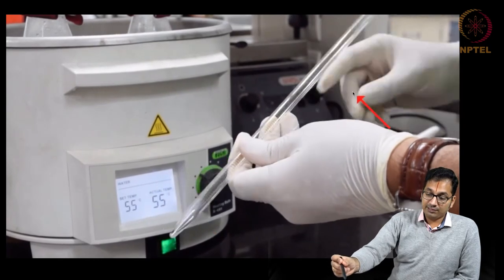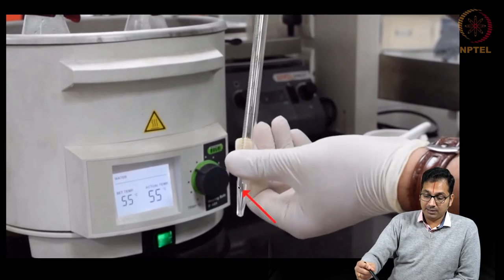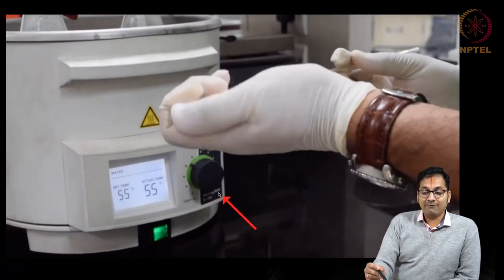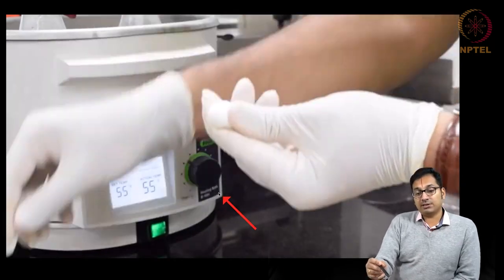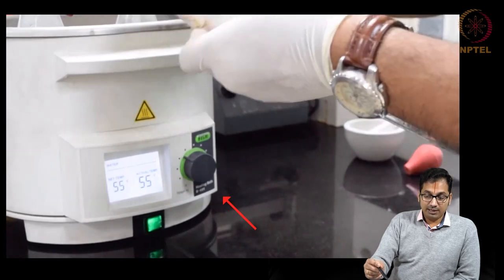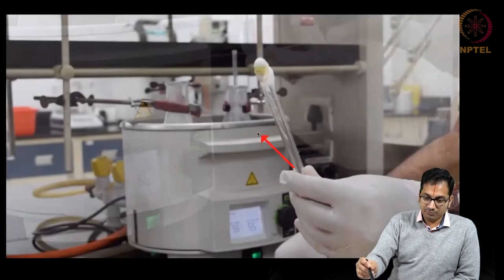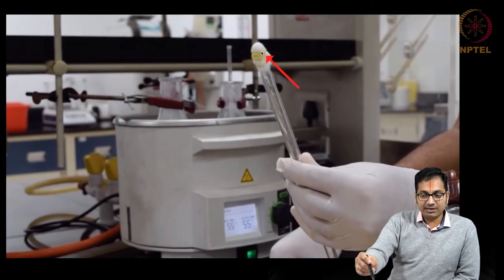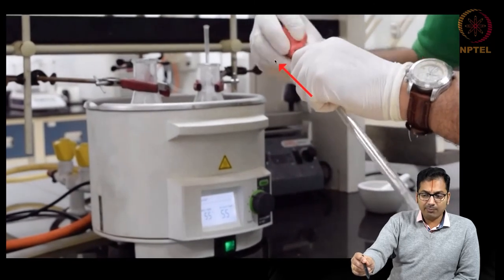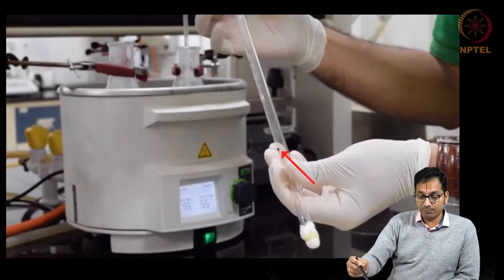And now we are trying to show you an example where you are taking the pipette and how you will be adding the cotton plug to it to ensure, when you are trying to take some solution out of the conical flask, minimum amount of solid comes up. So you take the cotton and use a rubber band and fix it around it so as to make sure that all of the solid, even if it comes, gets stuck in this cotton. Use a rubber bulb, never use suction from your mouth as a source because it could be harmful.